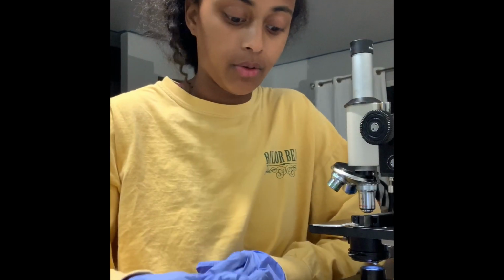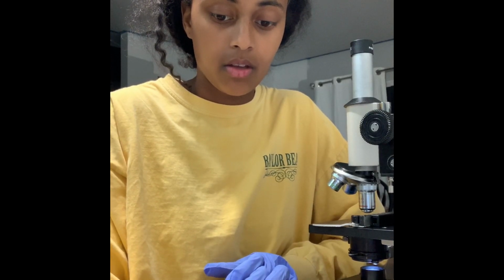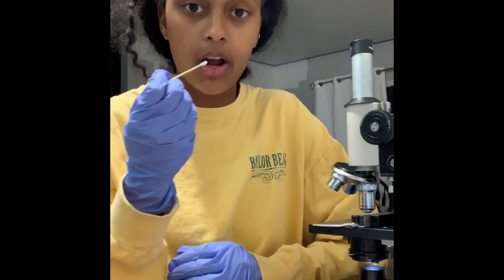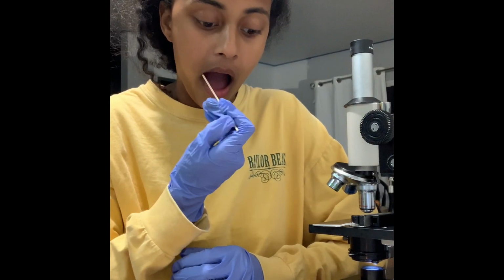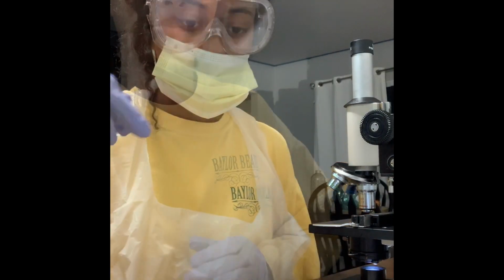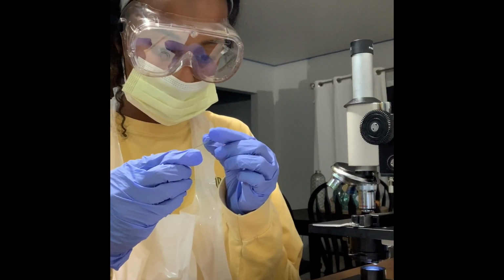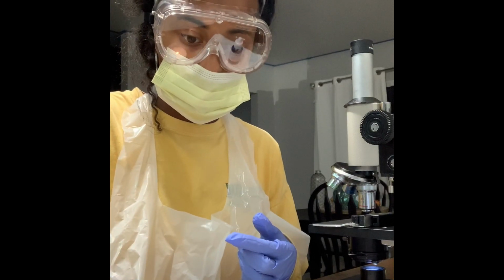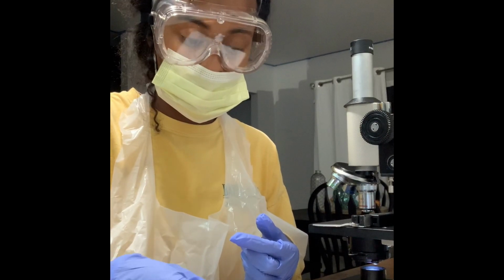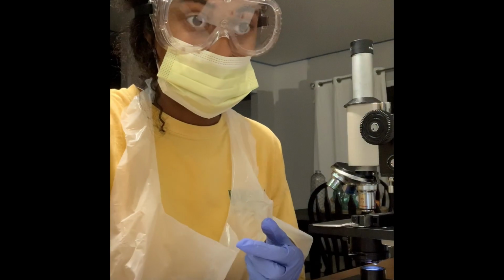So while that is drying, I'm going to light my candle, and just patiently make sure that it's completely dry, which my mouth is dry. So my slide is now completely dry, and I'm going to heat fix it by passing it through the flame. And we are going to let that sit for 10 minutes.